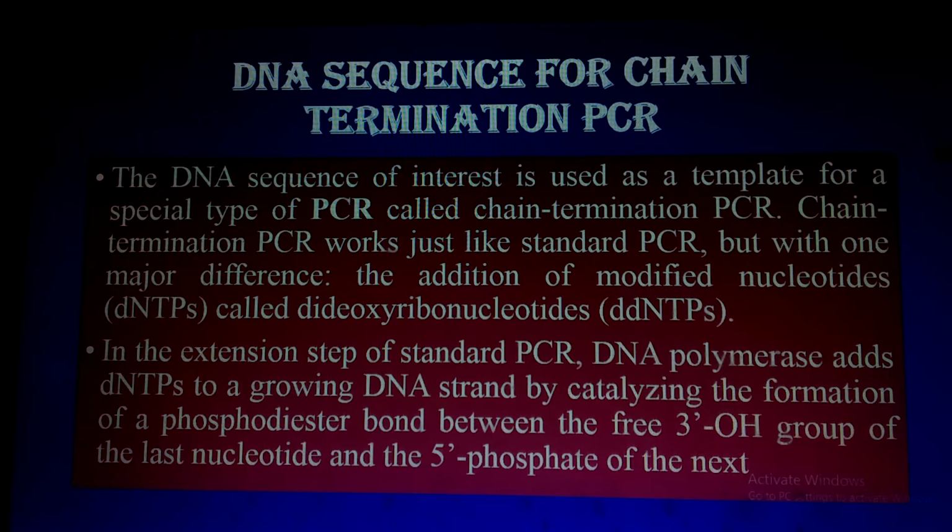Now the DNA sequencing by chain termination PCR, I will just give you the overview of the whole process. The DNA sequence of interest is used as a template for a special type of PCR called chain termination. All these slides I prepared for those students who asked for short notes for their exams. So I am providing them here. You can easily note down all this information, and you can make your own notes.